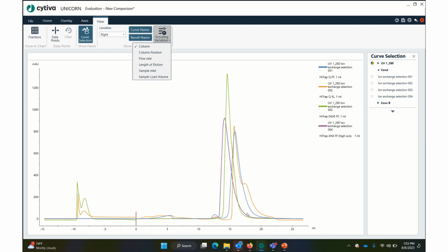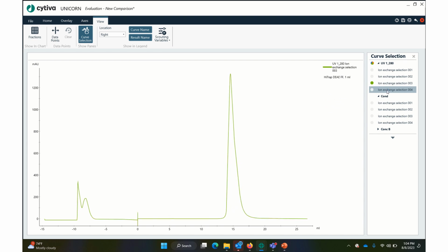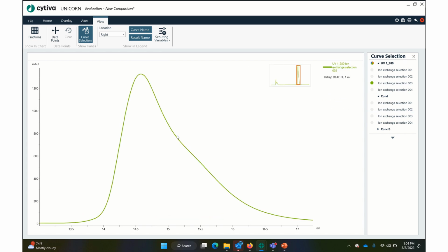Another thing I think is pretty interesting is that with run 3, there might be a little bit of a shoulder there too. Yeah, I would say that's a shoulder as well, though it's not nearly as well defined as the QXL. This is the DEAE. Let's turn those all back on.